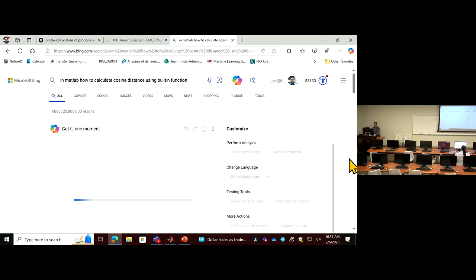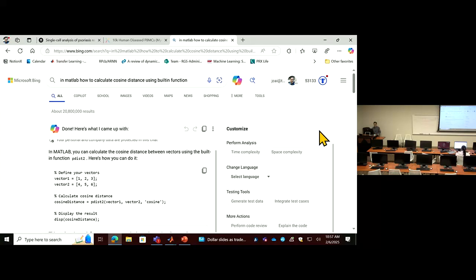So I try to find a function that has already been prepared for this.